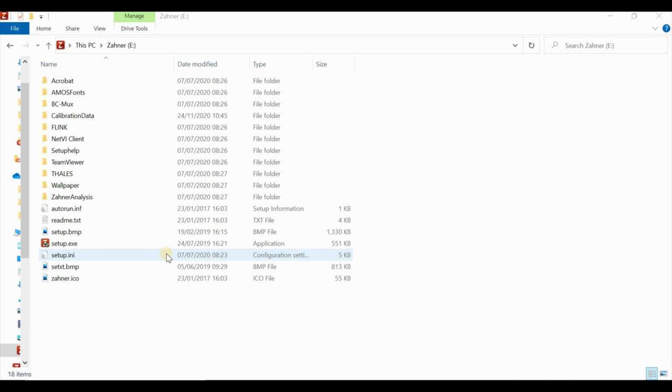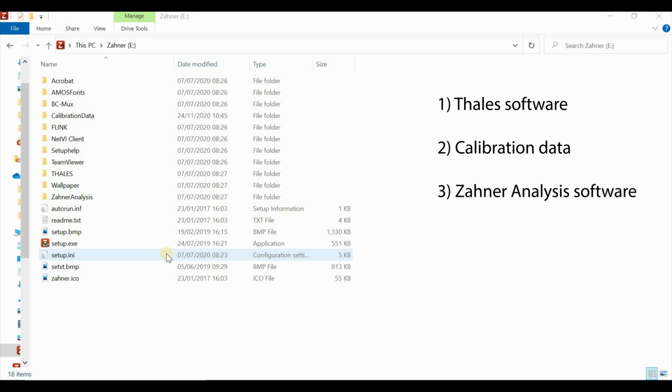Today in this video I'm going to show you how you can install the Thales software, how to install the calibration data for your device, and how to install the Zahner Analysis software. So with this, let's get started.